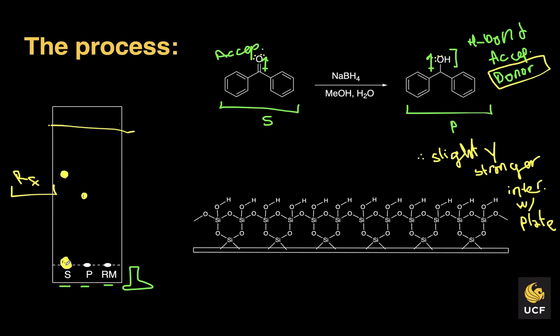That way it allows both molecules to move up the plate, but their separation and how far they move up the plate really depends on the solvent system. And you might change the ratio slightly from a solvent system being like 8:2, polar to non-polar, versus 9:1, and then that might affect the actual RF value, right? Or the separation that you actually see within the plate.